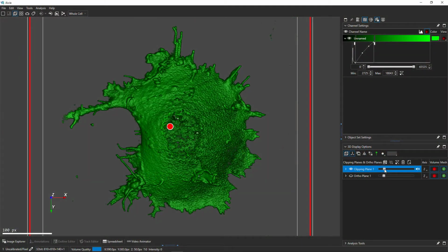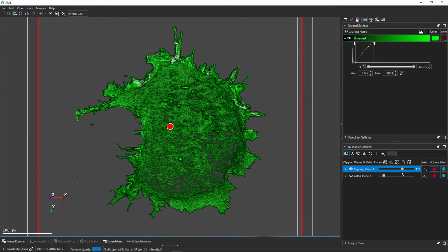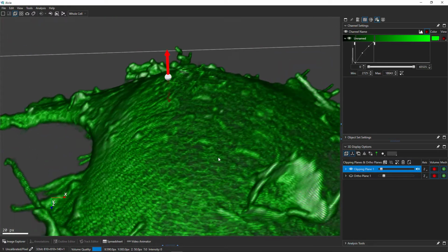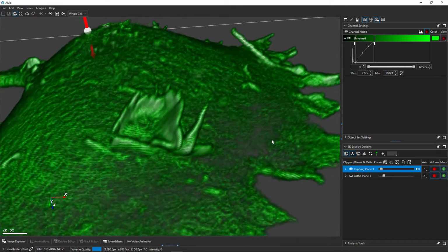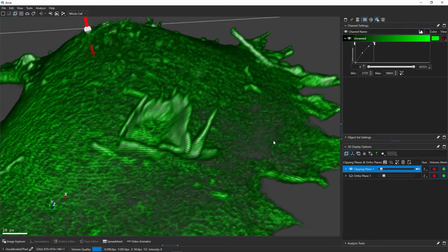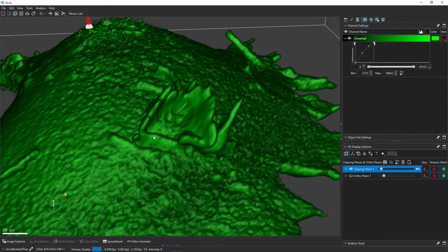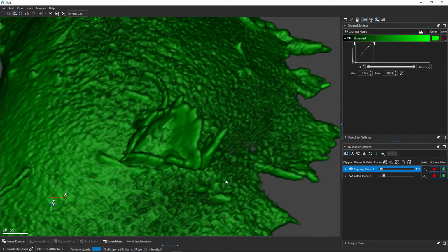In this demonstration, I will illustrate how to segment tentpole ruffling on a single cell. Tentpole ruffling has been described by several, and there is one particular paper I'd recommend, a recent one from November 2018. Nicholas Condon uses a lattice light sheet to image these structures dynamically. They appear as you can see them here, typically on the surface, but sometimes there are internal structures too that lead to this external structure.